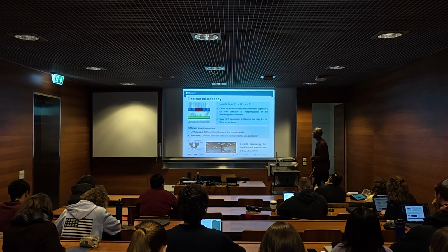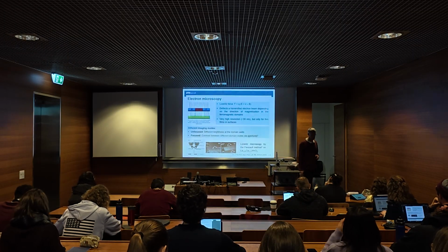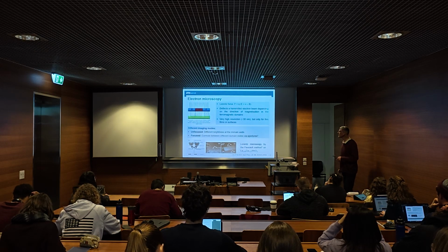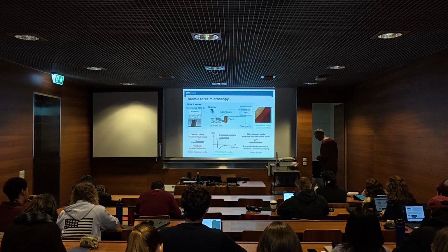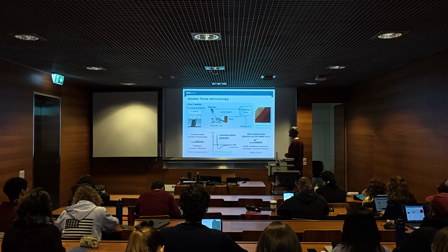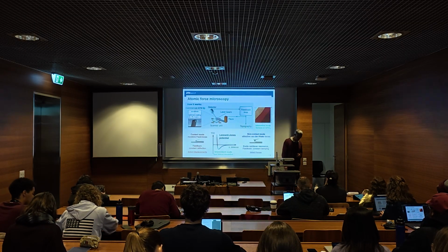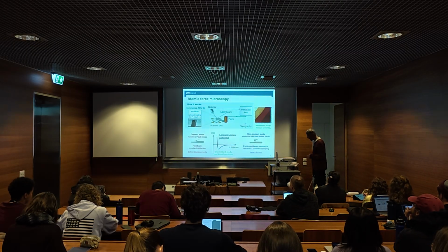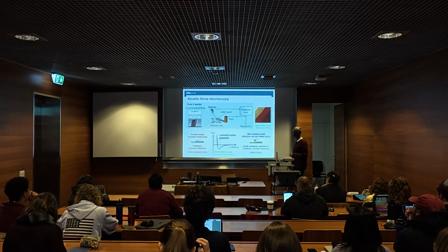Again, high resolution, but only for thin films or surfaces, because otherwise your electrons get stuck, or they don't even reach the inside. Yeah, a very, very powerful technique is atomic force microscopy. And many of you, or several of you, will most likely work with that during your master thesis, because many groups in our department make use of that.